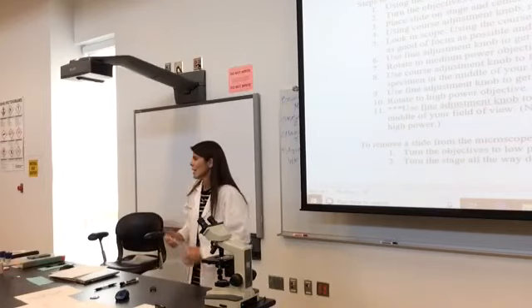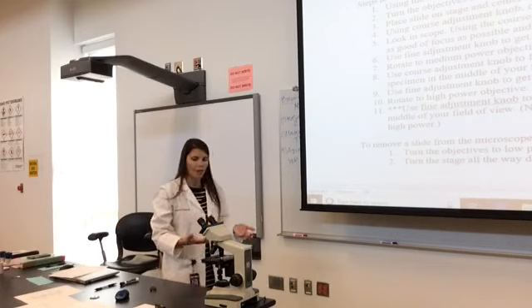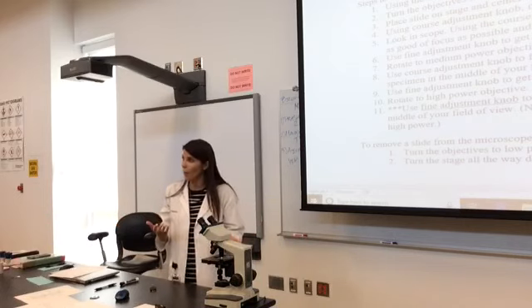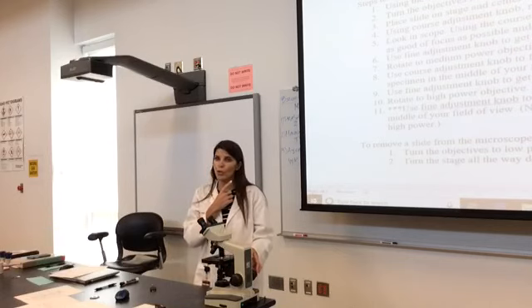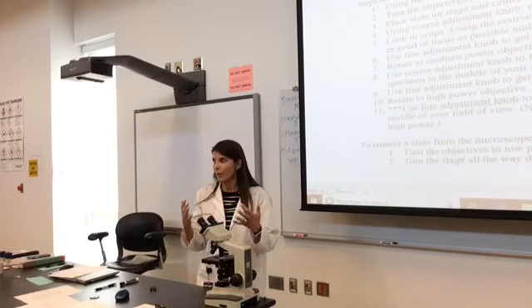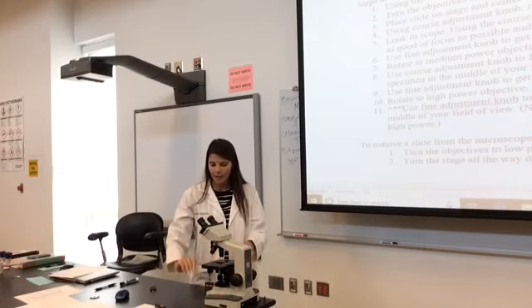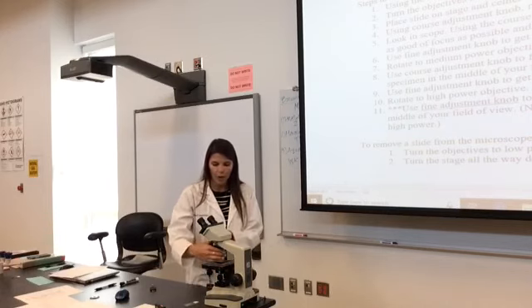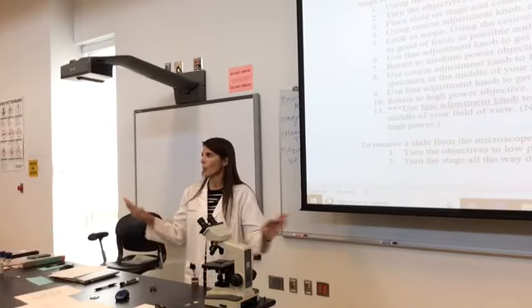And then I would say, hey, I'm done. Can you check it? And then I'll say, yeah, sure. And I'll look at it, and I'll be like, all right, great job. You should see something that is red, and again, I will show you what you should see before we start. So there's no, like, it's not here, it's there. When you're done, I'll say, now what do you do next? You drop your stage all the way down, remove your slide, engage your low power objective, turn it off, mic drop, and you walk away.